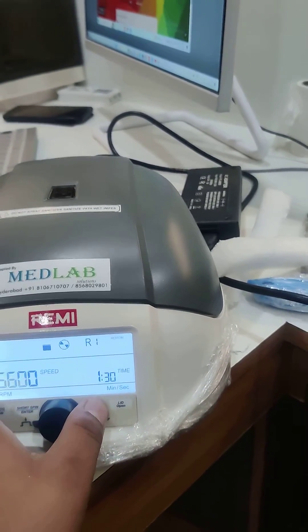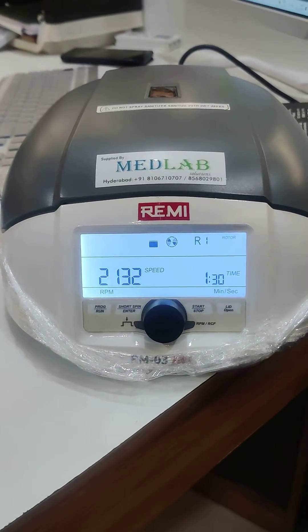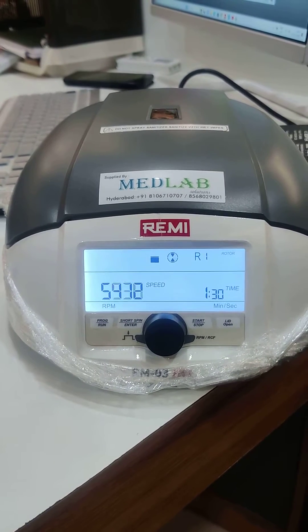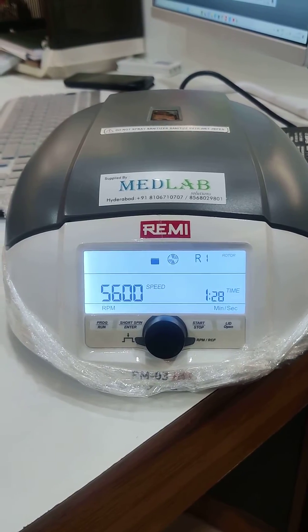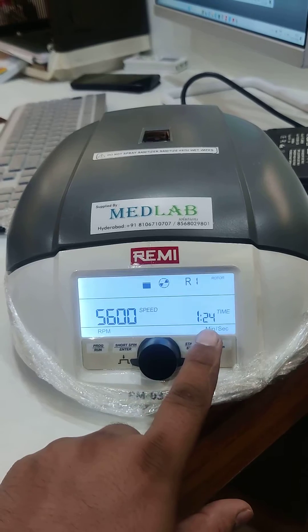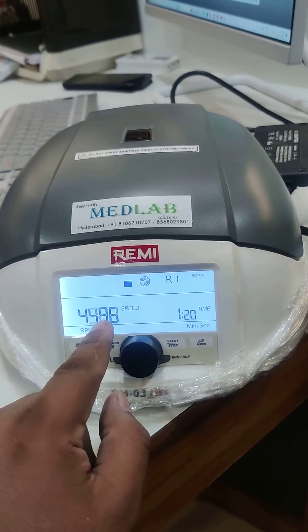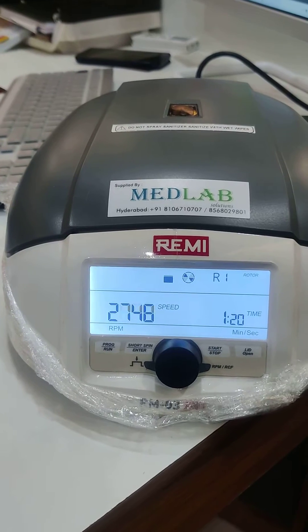Now click on Start. After reaching the desired RPM, the timer starts reducing. Click the Stop button. Once the RPM goes down, the machine will stop.